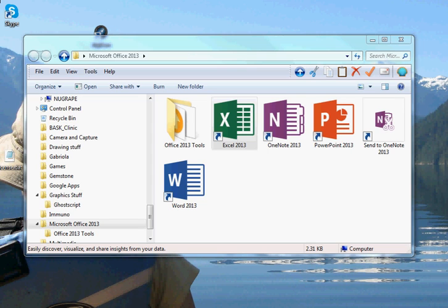This video is going to explore how to get data from a Dynaview, import it into Excel, and then graph it. So the first task is to get the data. If you had a USB drive plugged into the front of the Dynaview when you closed the recording process, then the file is going to be on that USB stick. You can just plug it into your desktop and find it that way.